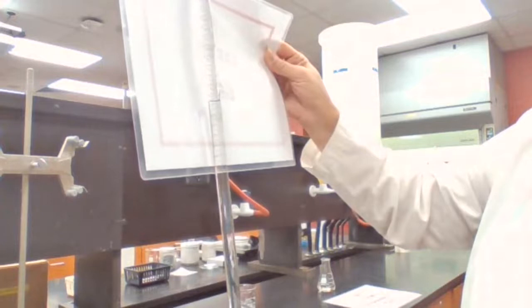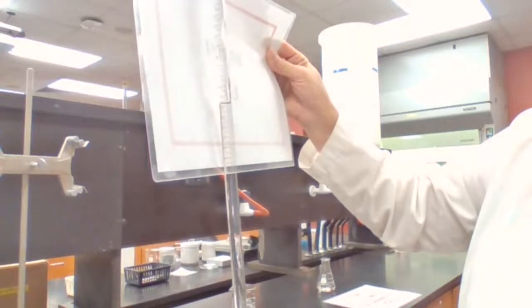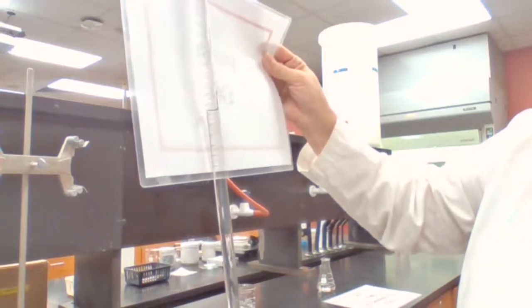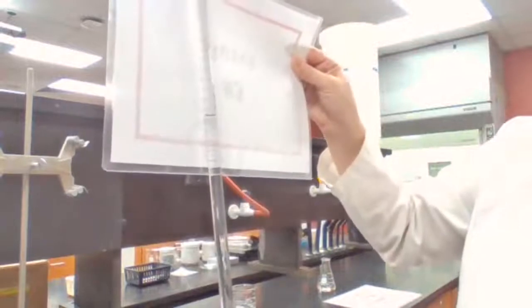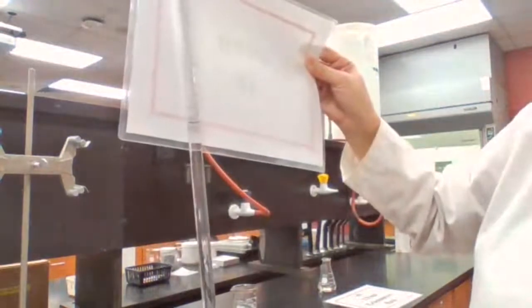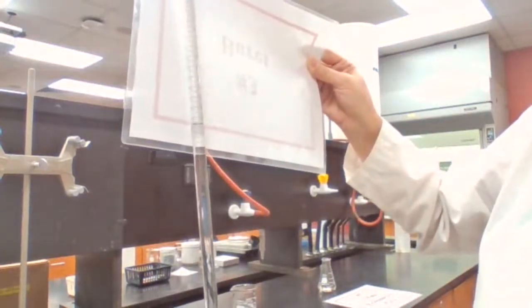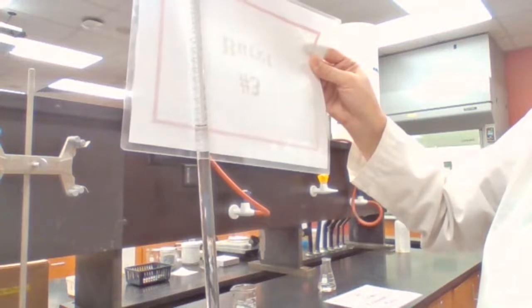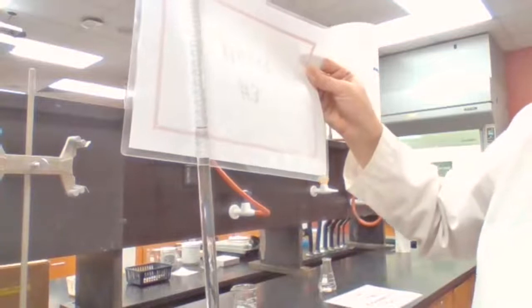And the lowest point here now is 26.123. It's not reaching 4, but it's very close to 4. Okay, I'm reading from the top. You read from top to bottom, so it's between 25 and 26. So it's going to be 25. You go down, because for a burette the numbers increase going down. It's 25.5, 25.6, but it's very close to 0.6. So it's going to be between 0.6 and 0.7, very close to 0.6. So it's going to be 0.62 in my estimation. Okay, so 25.62.